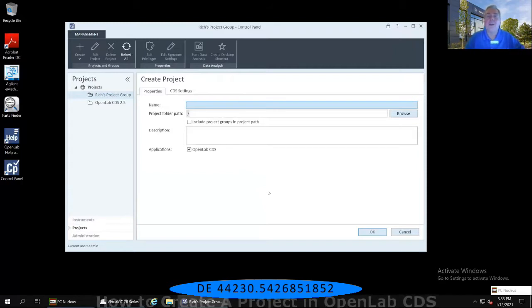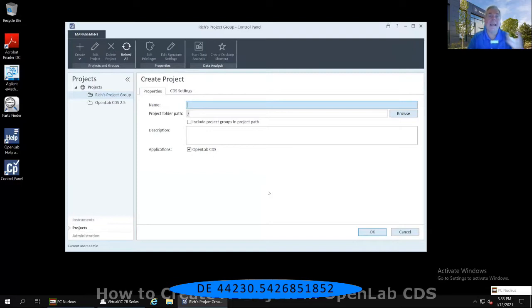And the reason is because there are certain things that cannot be changed once a project is created. So I need you to follow along with me while we create and visit each one of the sections of this project before we actually create it underneath that project group. Now, the first thing you need to do is name your project. I'm going to call mine Rich's Project.